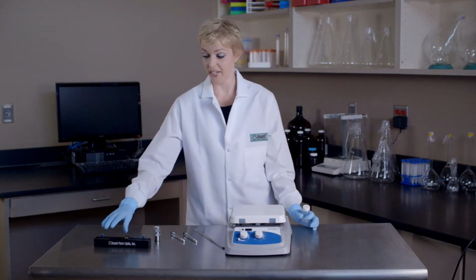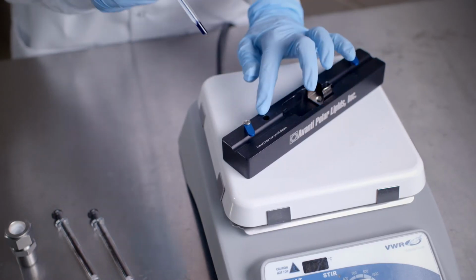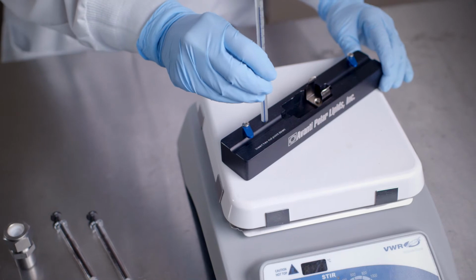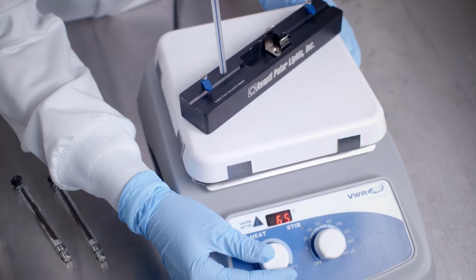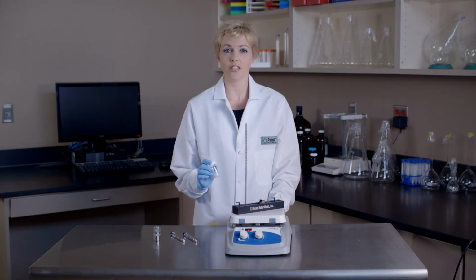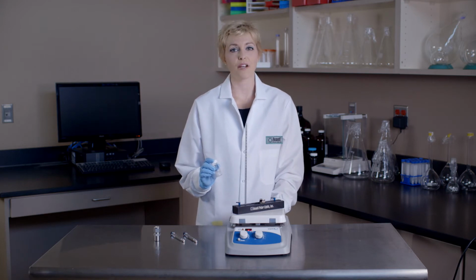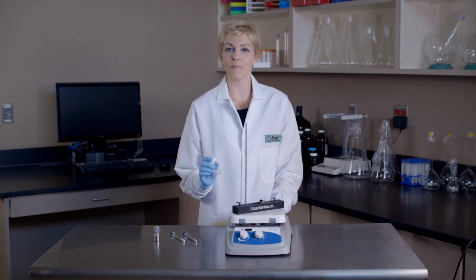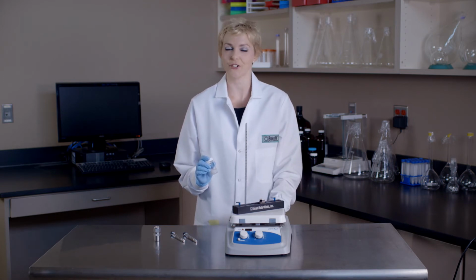To begin the extrusion process, we must first prepare our dry lipid mixture by lyophilization or evaporation. Next, we will place our heating block on the hot plate, insert a thermometer into the well provided on the heating block, switch on the hot plate, and allow the hot plate and the heating block to reach the desired temperature. Next, we will hydrate our dry lipid mixture using a suitable buffer for at least 30 minutes. Always remember, the lipid suspension should be kept above the phase transition temperature of the lipid during hydration and extrusion.